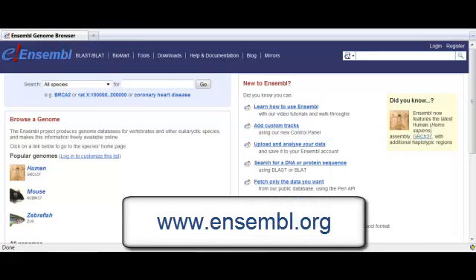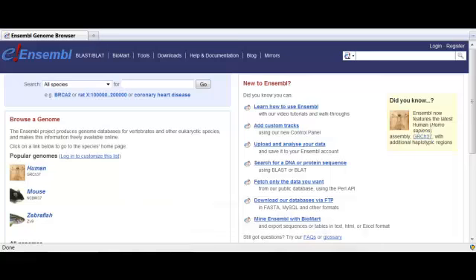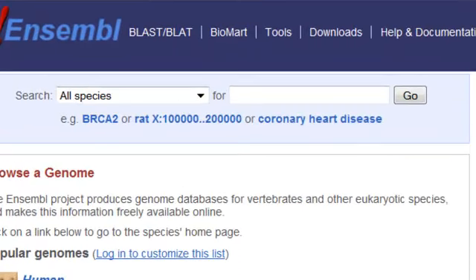In Demo 2, I'm going to go to a region of the genome and have a look at the structural variants there. So I could have, from the ZAP70 gene page, just clicked on that location tab. But coming back to the main page, I just wanted to show you how to get there if we weren't already in the Ensembl browser.